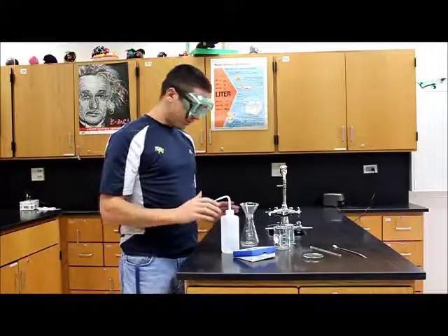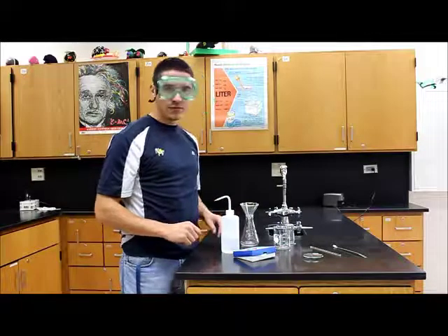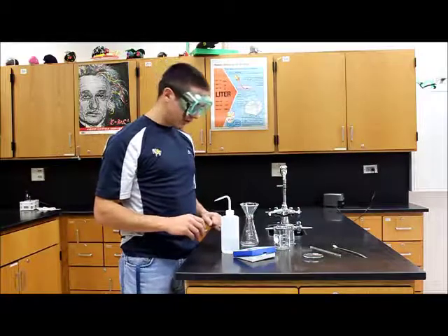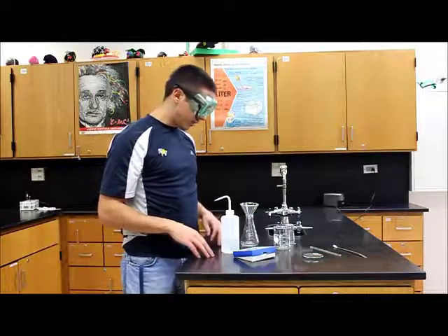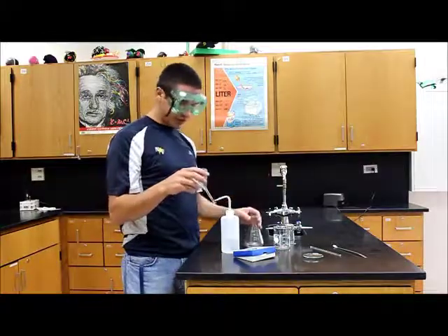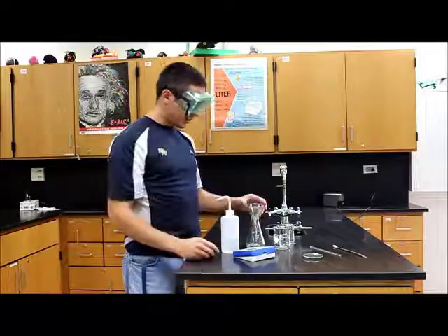Alright, well over here we have the materials besides the chemicals themselves that you're going to need for the lead 2 iodide limiting reagent lab. So a couple things that we're going to need here. You're going to need a flask to filter into. You're going to need a funnel. And this is going to be used for the filtering.